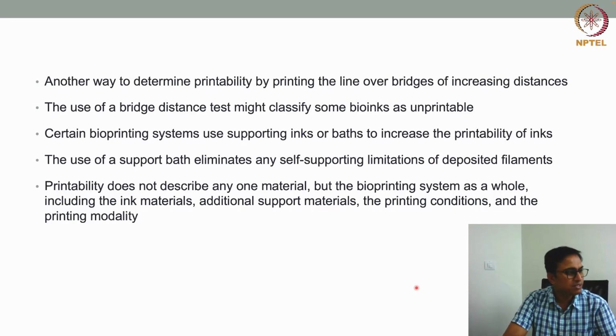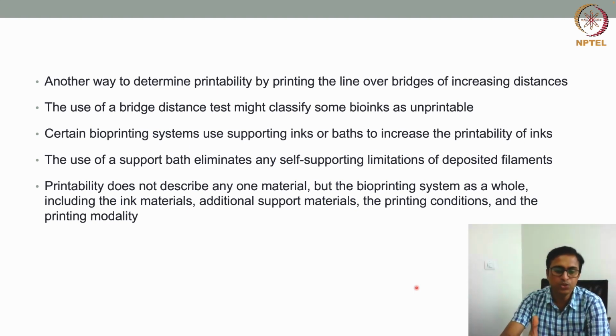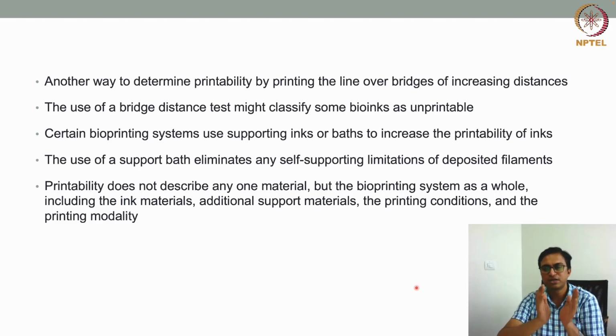In certain bioprinting systems we have discussed earlier, one such thing is 3D printing in a support bath. There they use a support bath or ink as a support material to hold the bioink during printing.